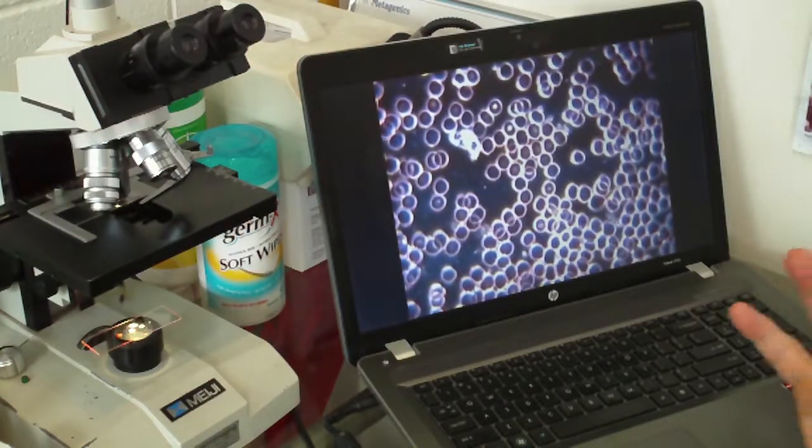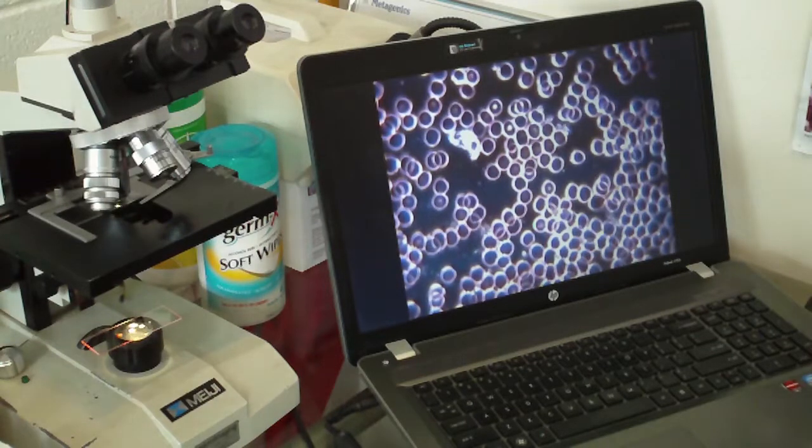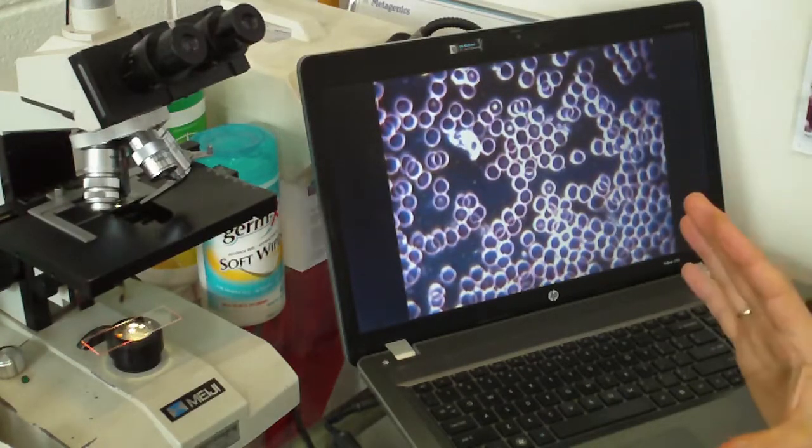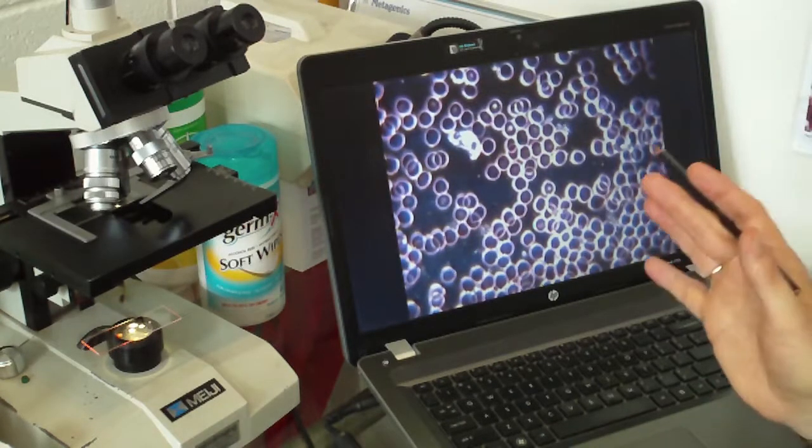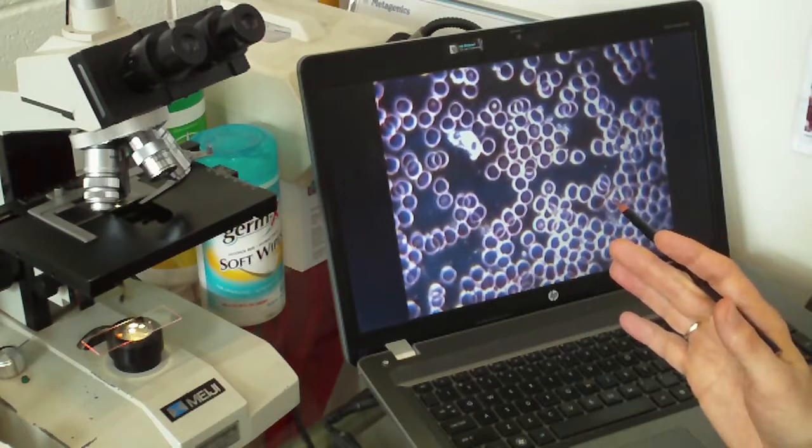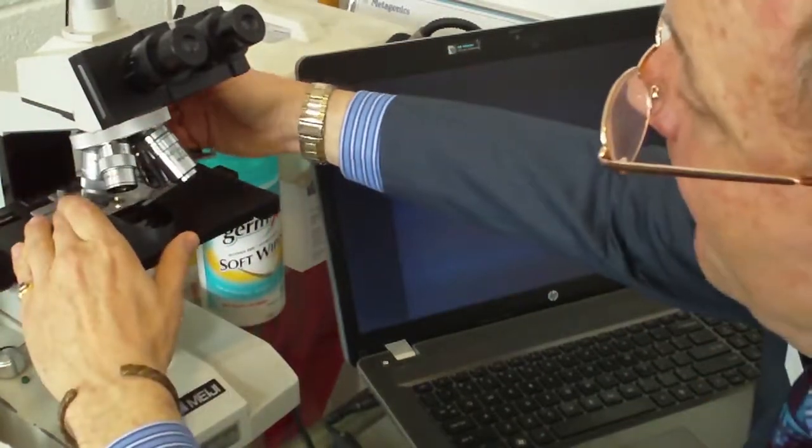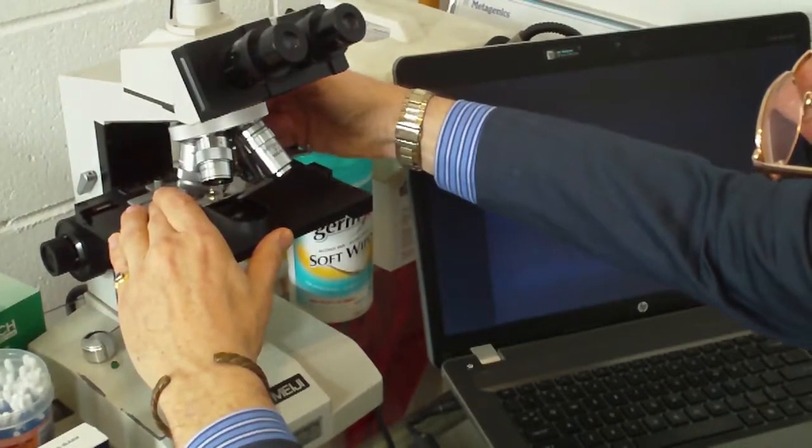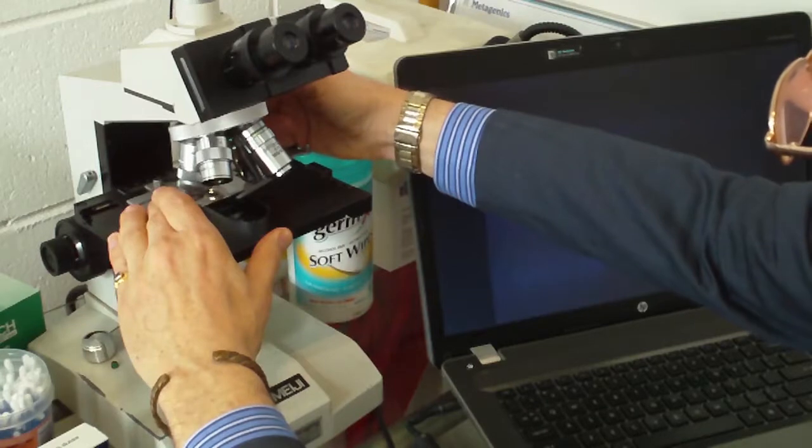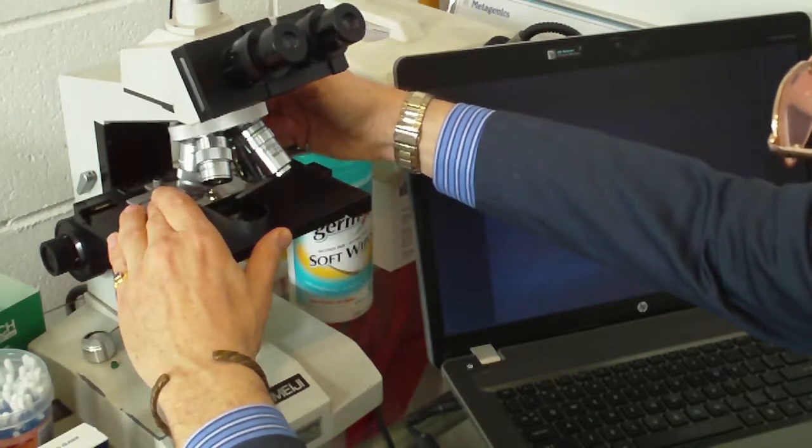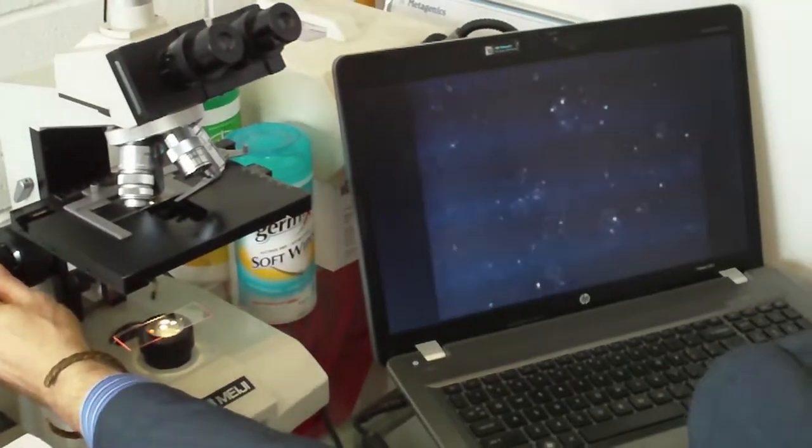There are two other tests at this point that I do. The next one I do is part of the Bradford-Coil system. This is not normally done by Hemaview technologists. So what I'm now going to do is I'm going to destroy the specimen deliberately, because I've had a good look at it. So I'm going to come over here. So I'm breaking up the specimen, destroying the red cells and white cells, because I want to have a look at the debris field that's left behind, because many parasites can hide in the debris field.